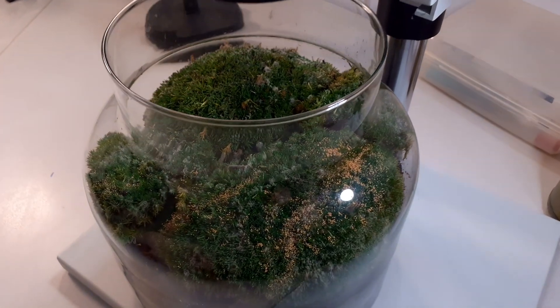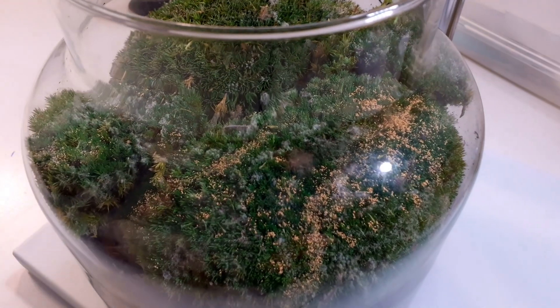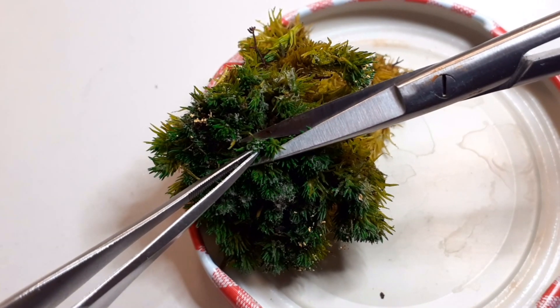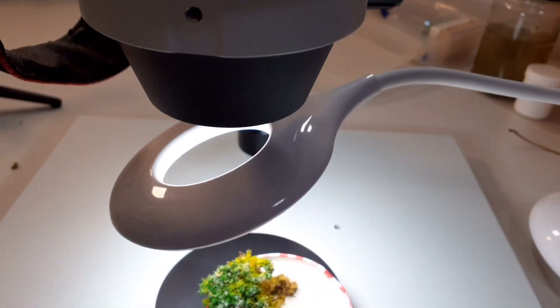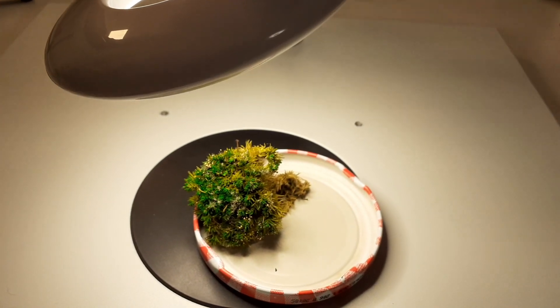This here is a mesocosm and it's in a pretty bad condition. Look at this — there's so much fungus and mold growing all over the place. So I decided, let's put it under the microscope, and sure enough, there were some beautiful spores visible.